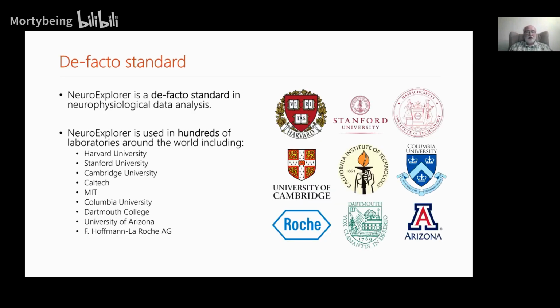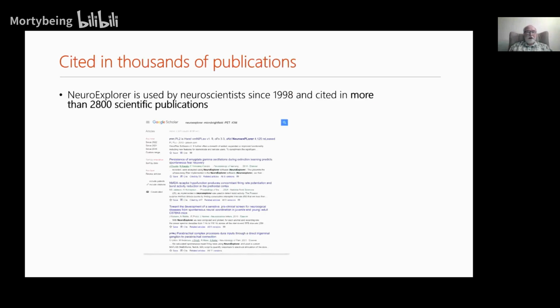NeuroExplorer is the de facto standard in data analysis of electrophysiological data. I know that it's been used in hundreds of laboratories. I just listed a few of them so you can show customers that leading universities use this product.